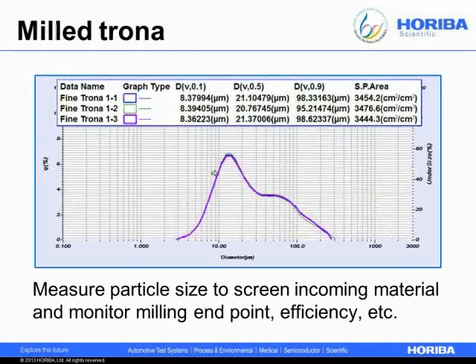Likewise, as we'll see in this slide, where I've measured milled Trona, which is much finer in distribution. You may also want to measure it to screen incoming material if you're buying milled material, or you may want to use it in a classic particle size application to monitor milling endpoints. You could also monitor the milling efficiency and when the mill is starting to wear down as well.